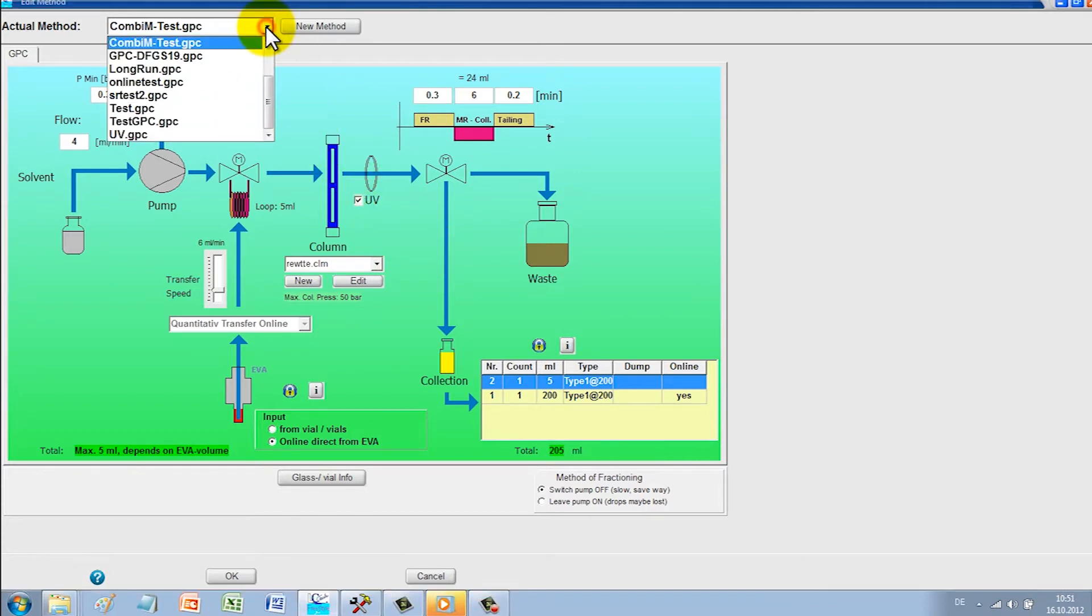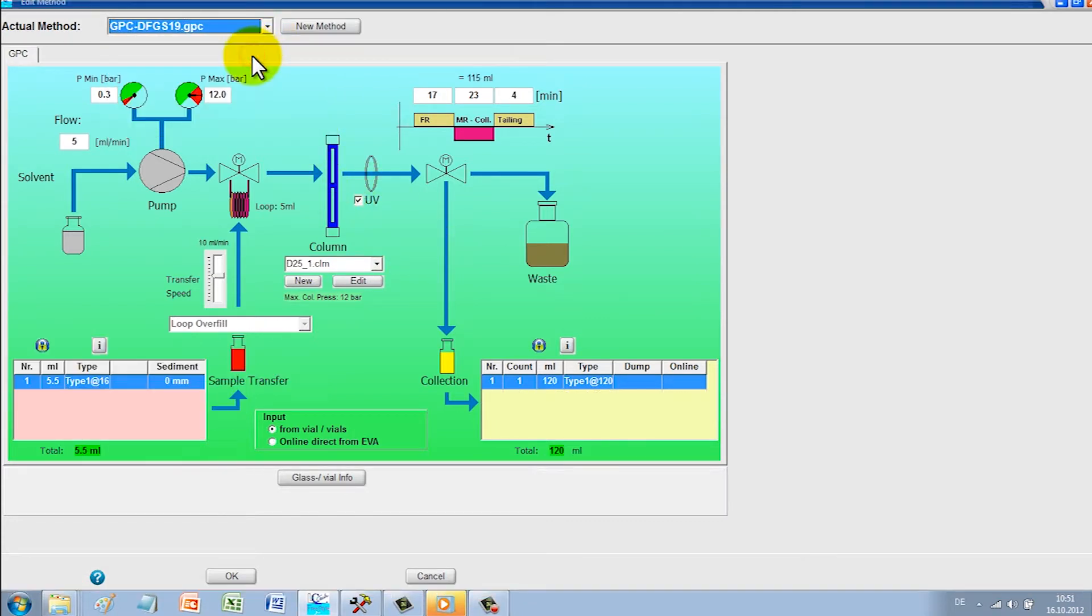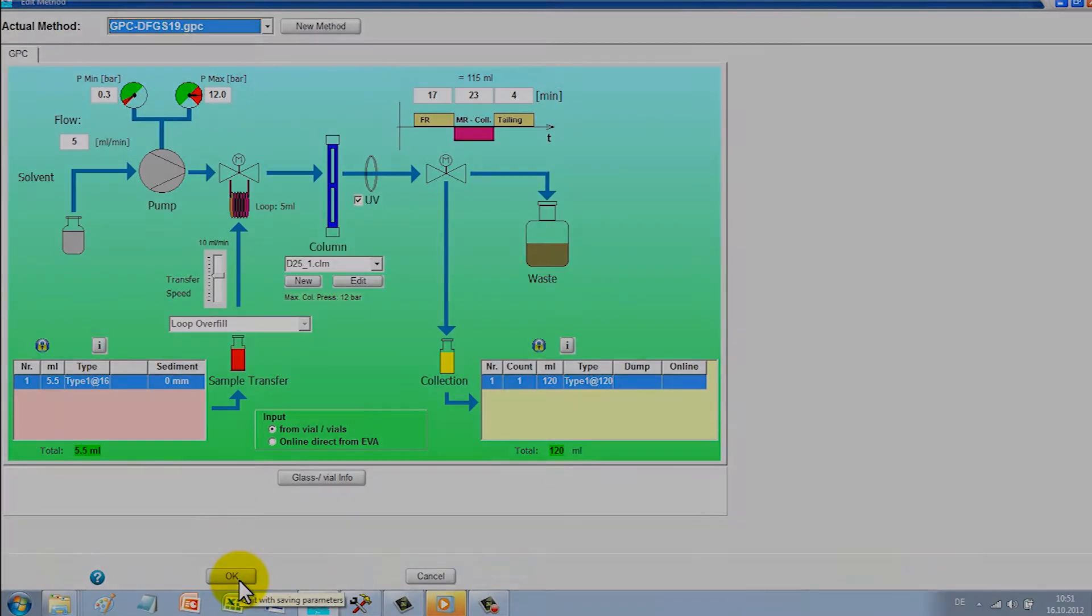The process determining parameters can be defined in a simple and logical manner, and the entire method can be saved. This area can be protected by allocating administrator rights.